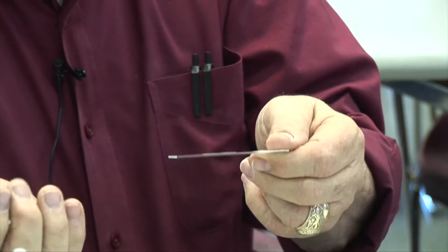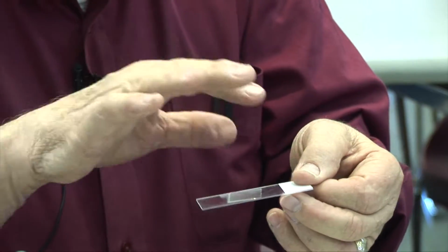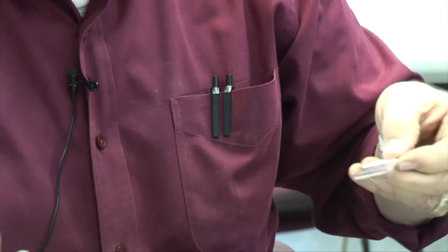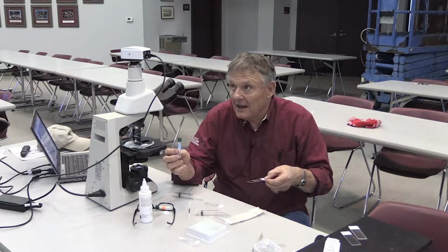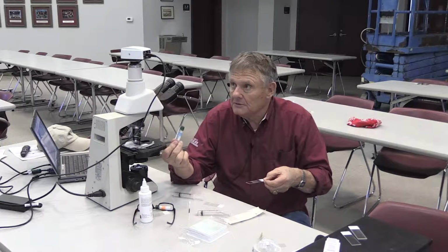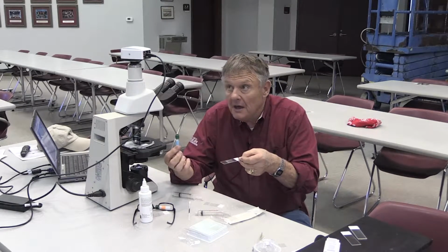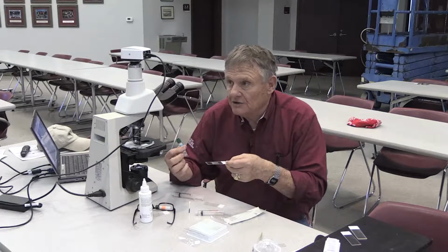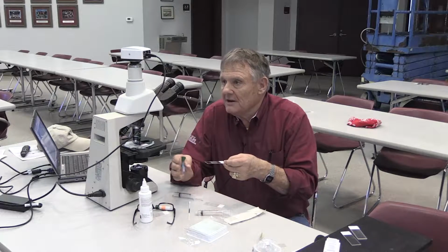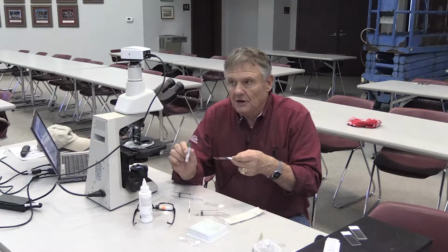Now, if the semen was extremely concentrated, I might want to put just a little bit more phosphate buffered saline. All I'm trying to do is get those cells diluted enough that I can see how they move forward. Veterinarians would have phosphate buffered saline; they purchase that, but I've just got it in a small container. We use that to dilute the semen, because if the semen is very concentrated, you can see movement, but it's hard to see progressive forward movement. So that's the reason we're diluting this out.